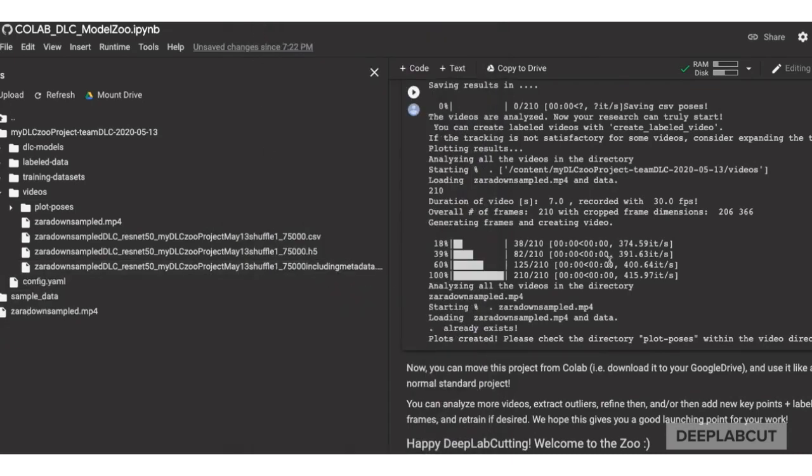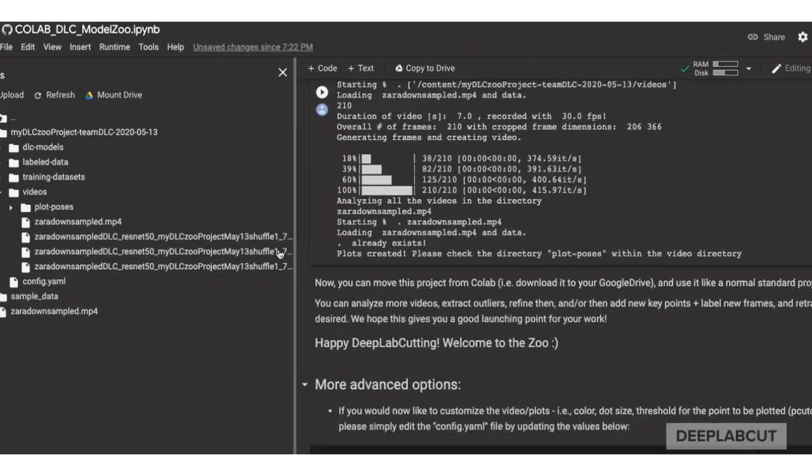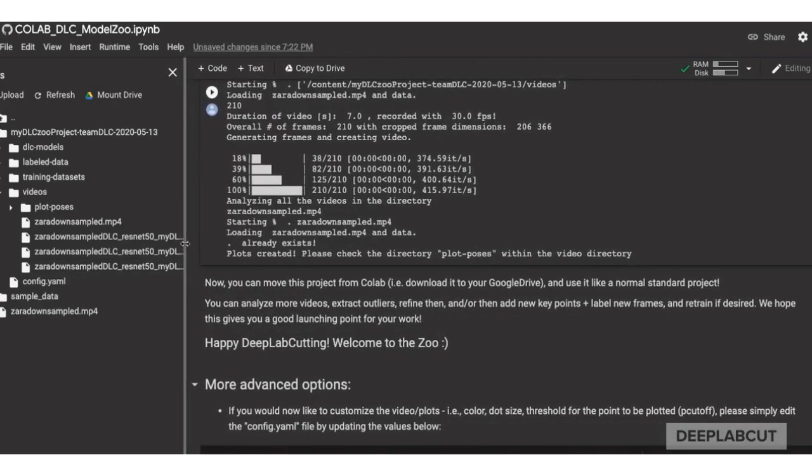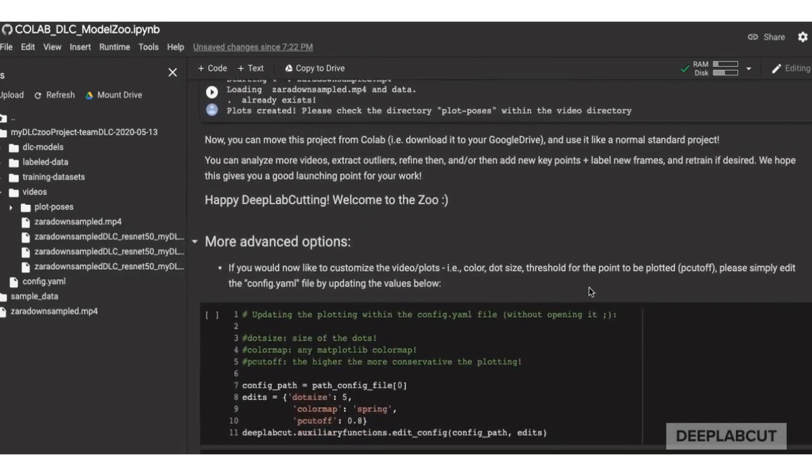Now, what I'll show you is that even though your project is completed and you could download it at this state, there's some advanced options that you can utilize. So if you delete the video, right click delete, then you can set things like the dot size and the color map and the cutoff.